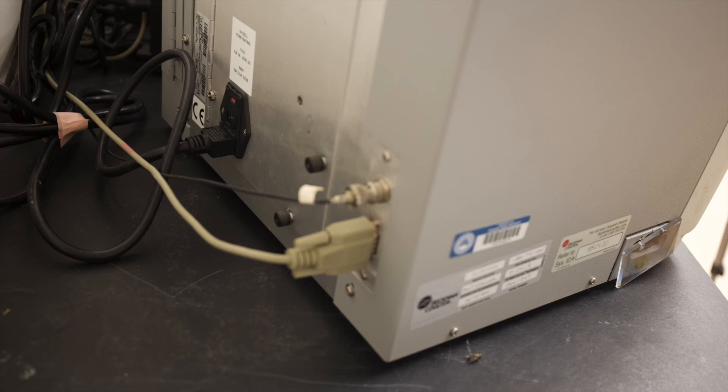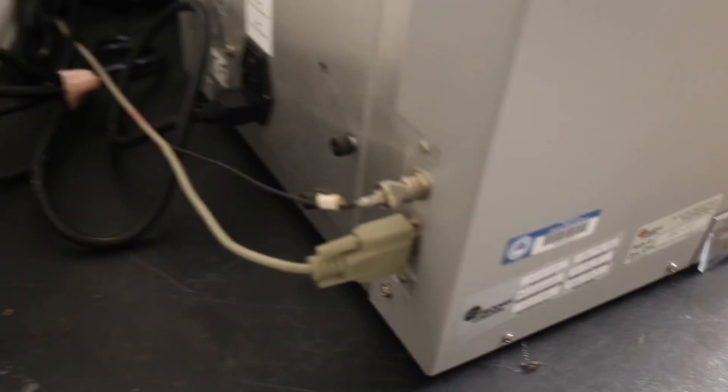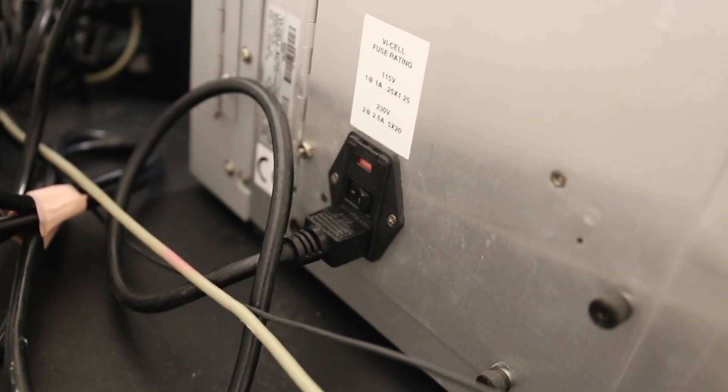Here is a view of the back of the machine. Before beginning, make sure that all cords and cables are securely attached to both the machine and the computer. Doing so will ensure that the pictures the machine sends to the computer are clear and readable for the software.